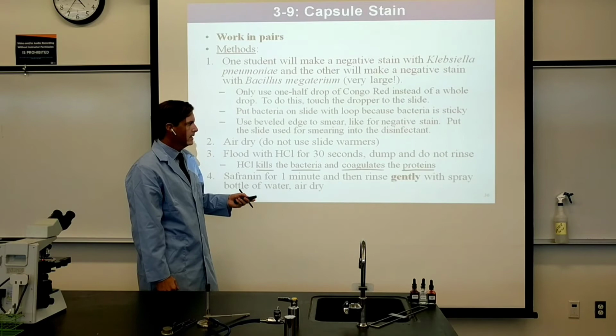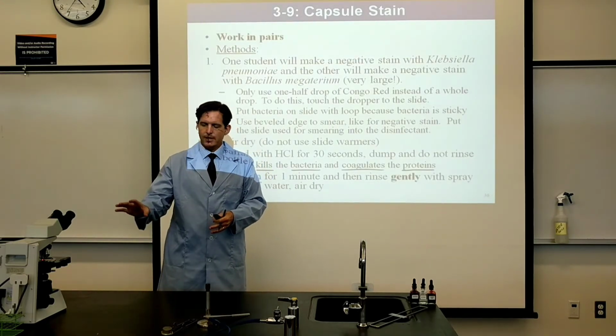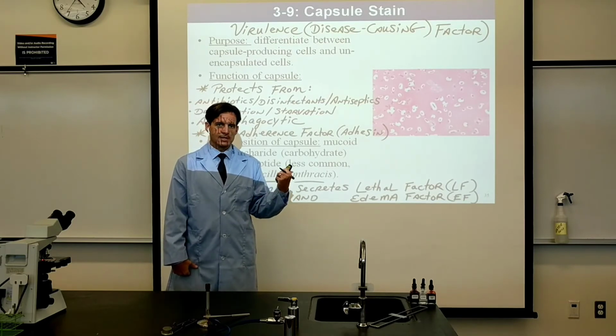Okay, so now it's time to pause one more time, and we're going to look at the capsule stain result through the microscope. And remember, we're looking for something that's going to look similar to what we see in the picture here.